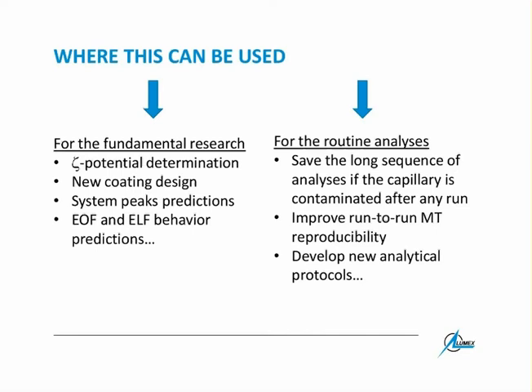In order to make express analysis, you can inject from the outlet end of the capillary, and then you have only 7 centimeters to analyze all components of your sample. In order to do this, you need only 12 minutes for the whole protein analysis. 12 minutes is nothing compared with the standard protein analysis and protein separations, yeah? So you use the short end of the capillary to analyze your proteins.